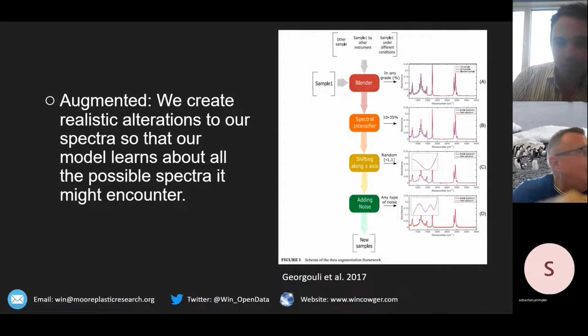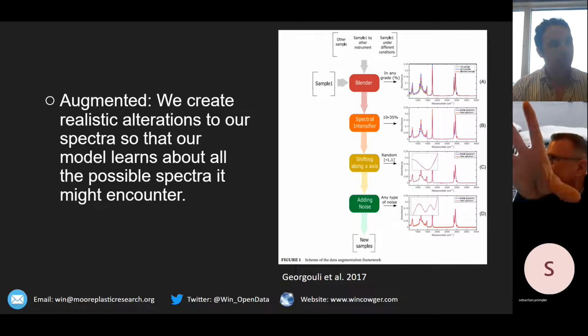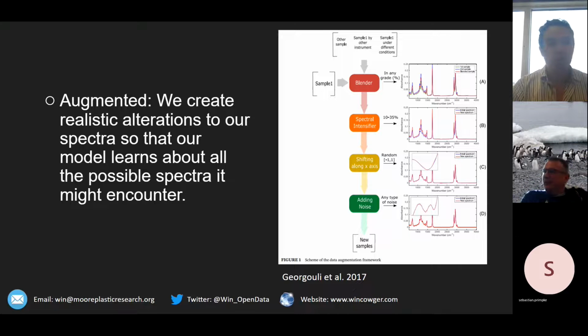And another thing which was not on your presentation, but we discussed yesterday, you were also interested in looking at pyrolysis kind of data. Is that one of the things that you want to look at in the future, because that's very much disconnected from spectra. Right. Spectra, but it's very much a new thing for me, and honestly, it's not my expertise.